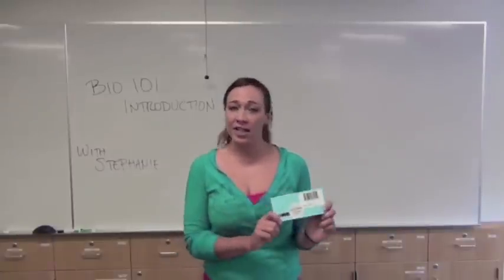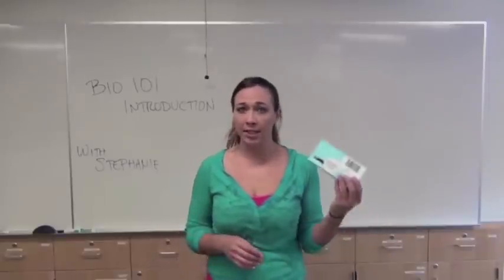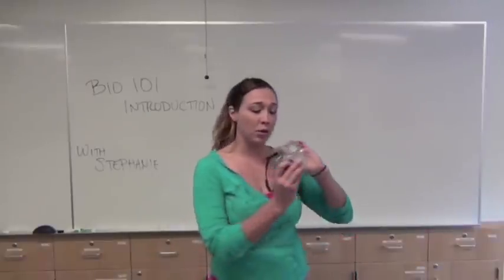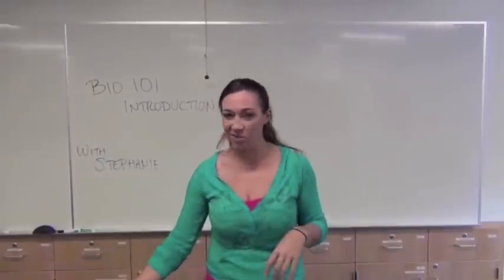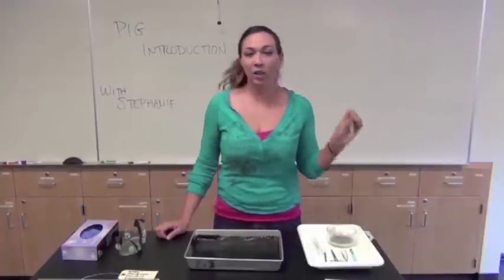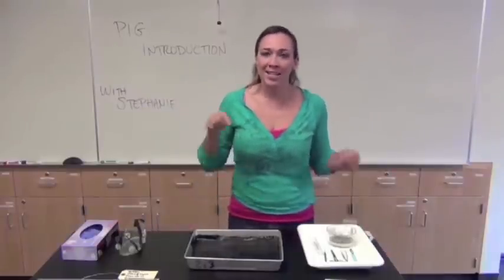Next you'll need your dissecting kit, which you can purchase at the bookstore, but you can share it between partners — each pair gets one pig. You'll need goggles that completely cover your eyes. Inside the dissecting kit you have a ruler, probe, scissors, tweezers, a scalpel, and tiny little pins. These pins are useful for pinning back parts of the pig, and they press nicely into the wax bottom on the tray to keep things straight.